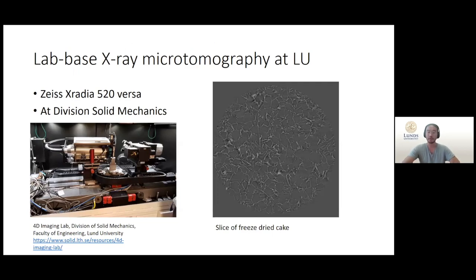So the first part of our experiment where we look at the structures was performed at the Division of Solid Mechanics at Lund University. The equipment we used here is an X-ray lab tomograph from ZEISS and it's a state-of-the-art, very good equipment. After scanning we obtain slices of freeze-dried material that we can build up to obtain a 3D image of this structure.